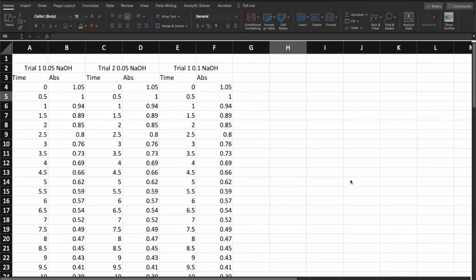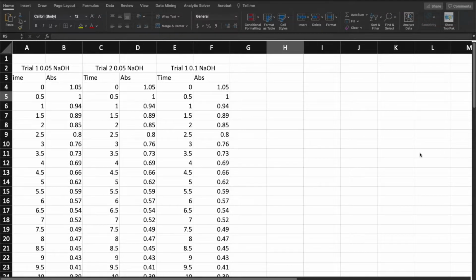Hello everybody. I decided to re-record this video on how to do the data analysis for the Kinetics lab because the original video I recorded during the lab itself was kind of choppy and hard to follow, because I kept stopping to help people. So the video you're going to watch now will be straight through on how to do the data analysis for the Kinetics lab and how to answer the discussion questions that we have at the end, right?